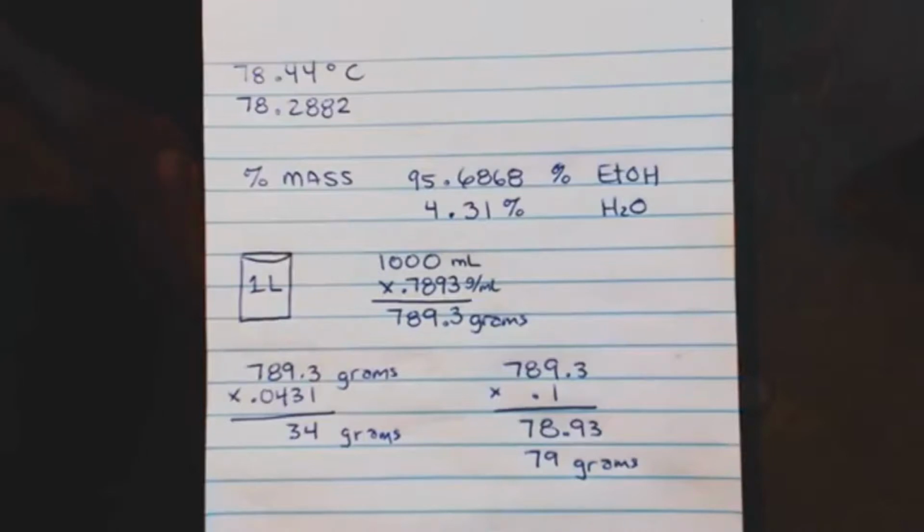I think most molecular sieves, if they're good, will absorb 20% of their weight in water. So throw them in, and like I said, if you want it bone dry, you're going to have to leave those molecular sieves in for a couple days, at least 24 hours.